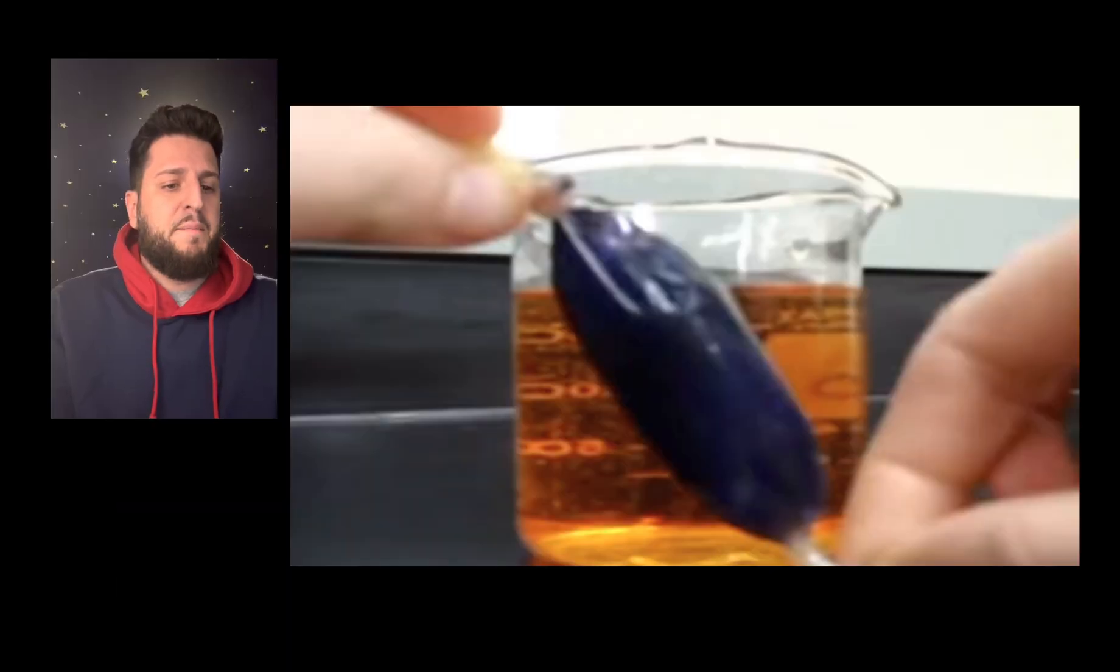After about 10 minutes, you notice that the color has changed within the dialysis tubing. If one were to test for glucose inside the dialysis tubing, it would test positive. If one were to test the liquid within the beaker, there would also be a positive for glucose on the test strip.